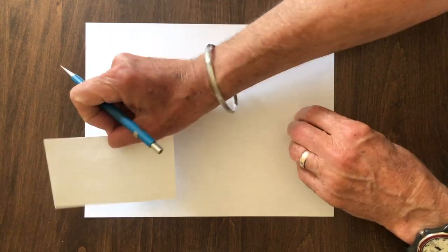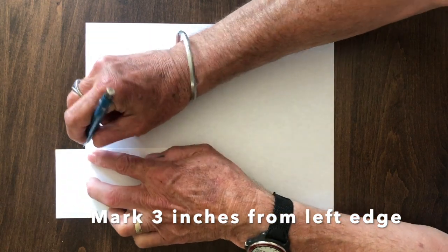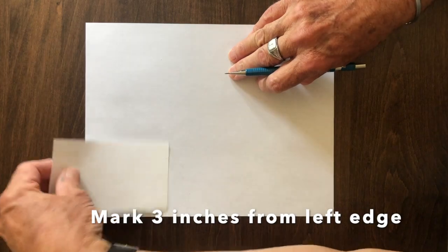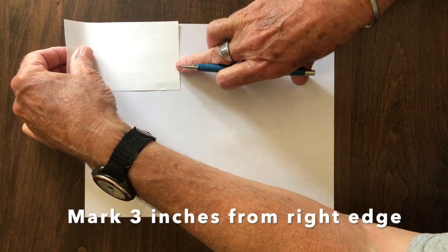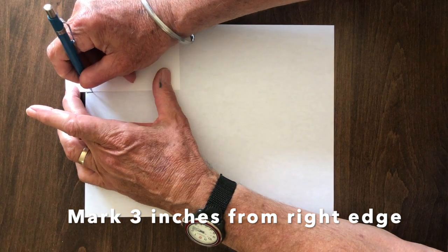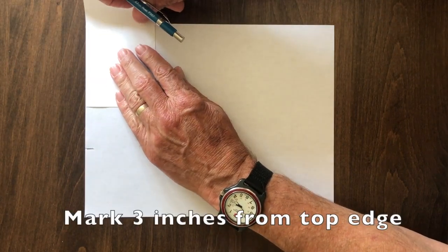I use a three by five card to mark off three inches from the upper left corner like that, and likewise three inches in from the upper right corner, make a mark.